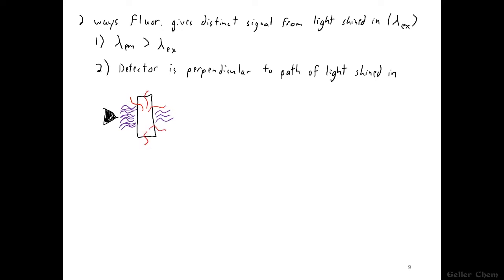Well, the emitted light is completely random in terms of what direction it's going to come out in. Some of it might actually even go backwards towards the original light source, and some of it will go forwards along with that transmitted purple light. There is really no favored direction when it comes to these molecules emitting light. It's random and it's equally probable in all directions.